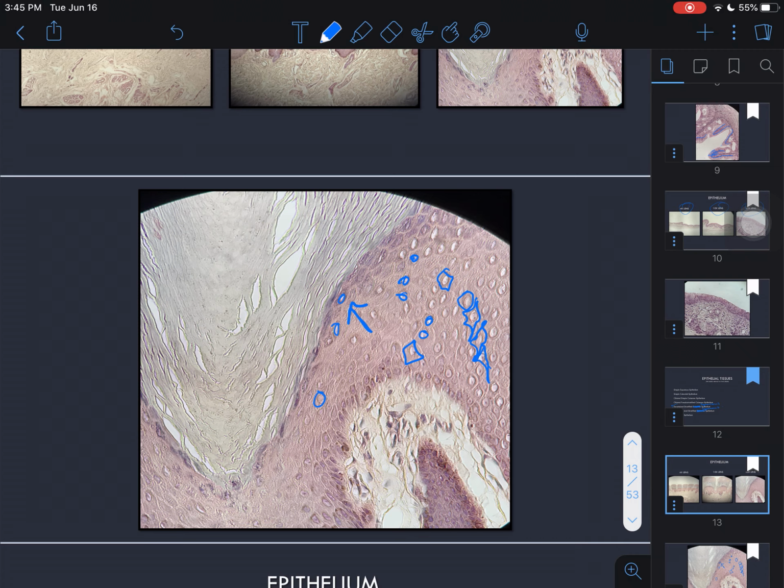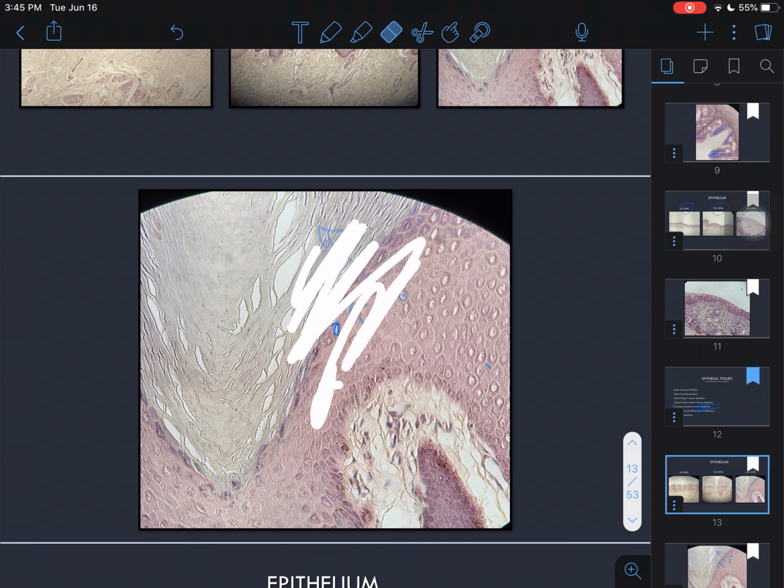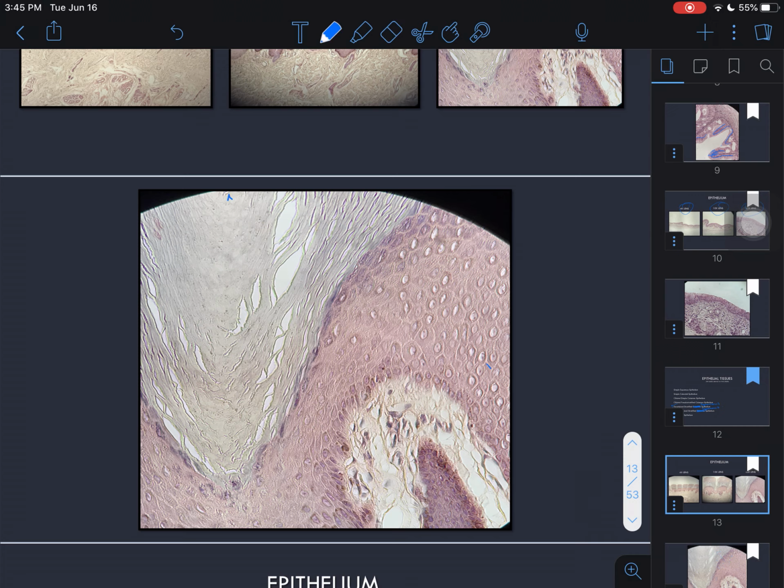This is an avascular tissue, right? And as they push further and further this way, they become less and less, well, alive. They become dead until they hit the actual keratinized section right here, in which the nuclei have actually completely disappeared, but there's still several layers of those dead cells there, okay?